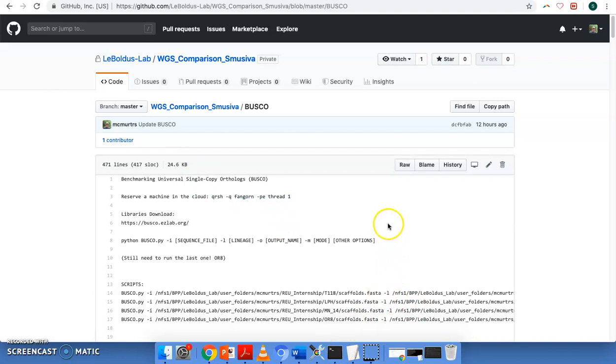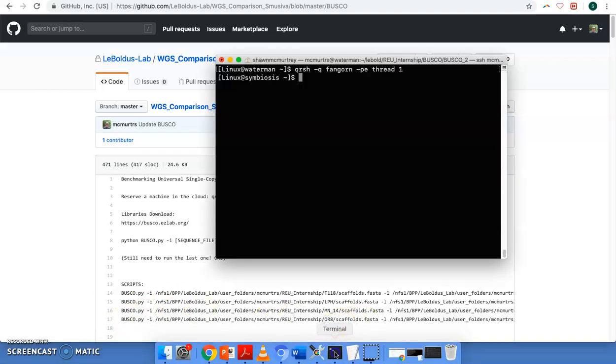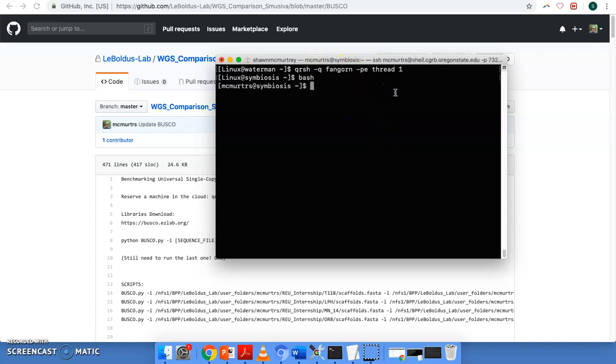And so first off, we went ahead and wrote the script. But what we're going to want to do first is after we've reserved our machine, we need to do bash. And then this changes to my username here.